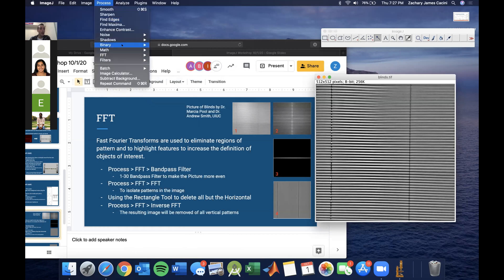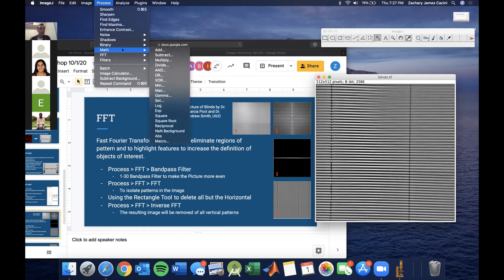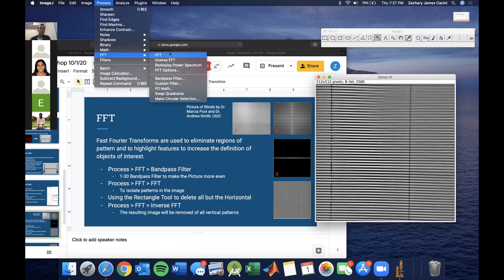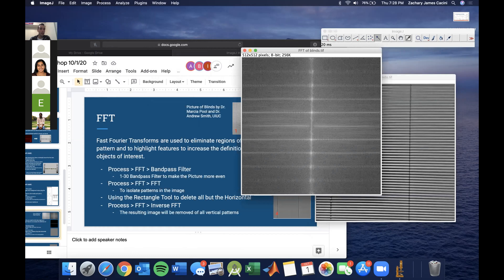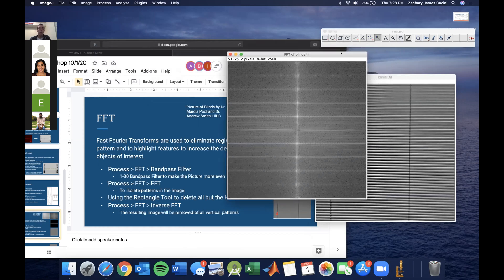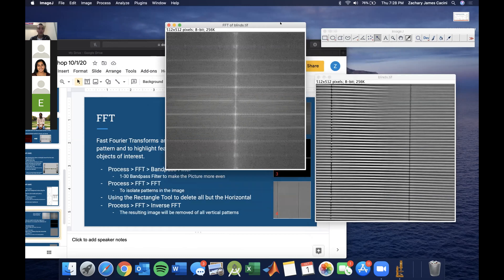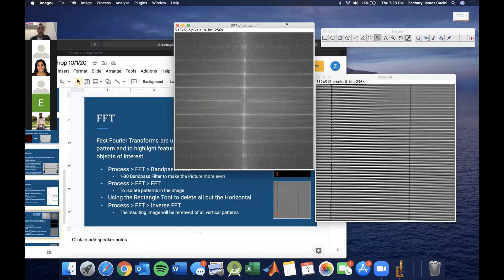Now we're going to do the actual Fourier transform — just as easy as Process > FFT > FFT. This is what it'll look like. Galecki will go into more depth about what the Fourier transform really is.